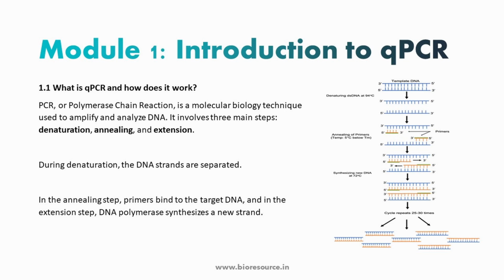The primers are short oligonucleotides of 20 to 30 base pairs in length. These are specific sequences that target your DNA template. So once that is done, we keep the annealing for around 30 to 34 seconds, wherein the primer binds to the DNA strand in a specific region, followed by increasing the temperature to 72 degrees. That is the optimal temperature for Taq polymerase.